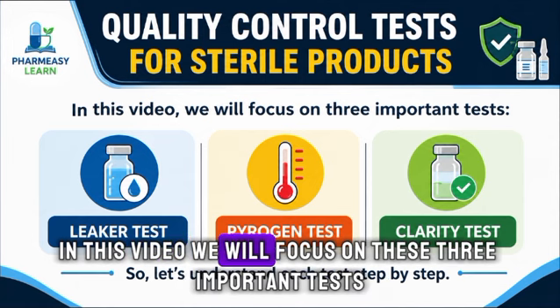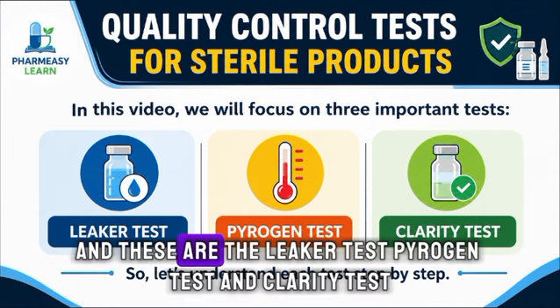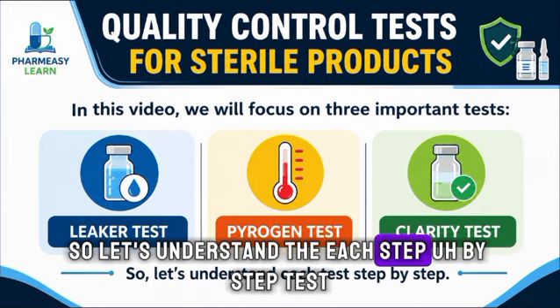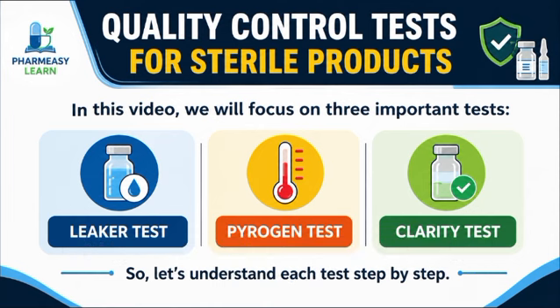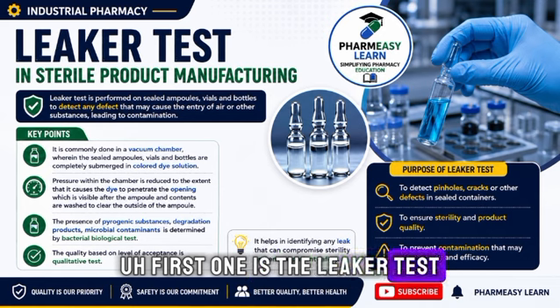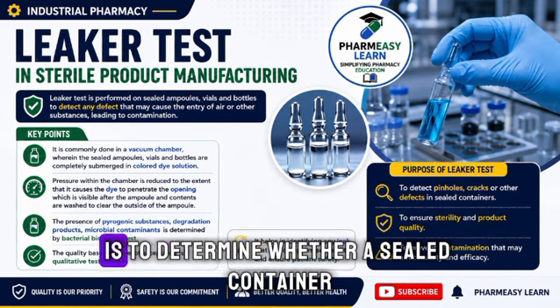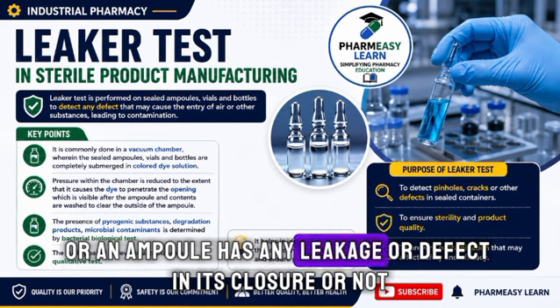In this video, we will focus on three important tests, and these are the leaker test, pyrogen test, and clarity test. So let's understand each test step by step. First one is the leaker test. As the name suggests, the purpose of the leaker test is to determine whether a sealed container or an ampoule has any leakage or defect in its closure or not.